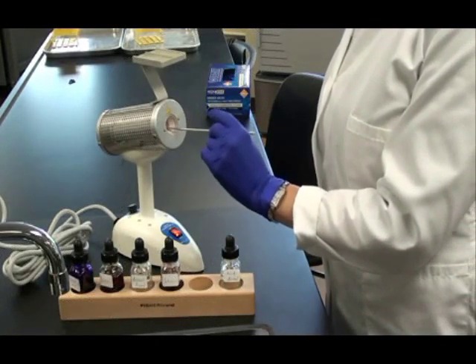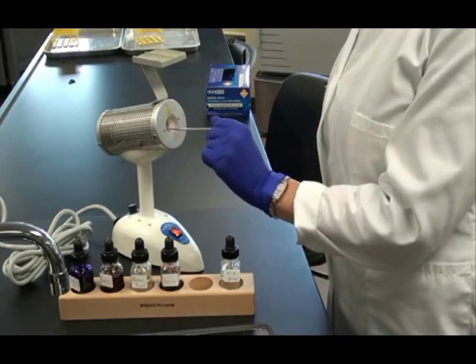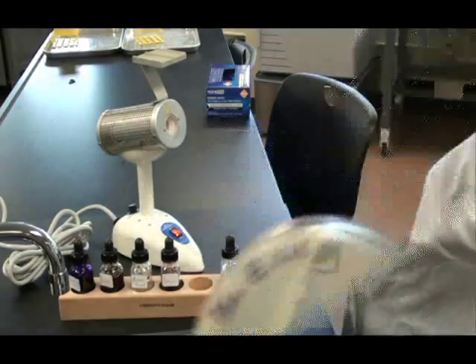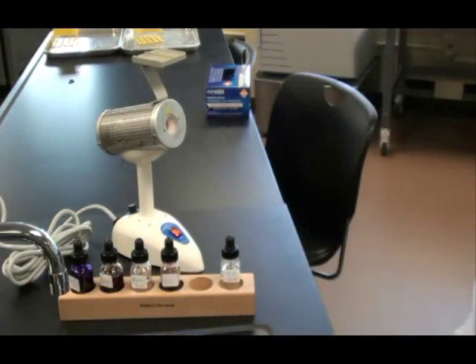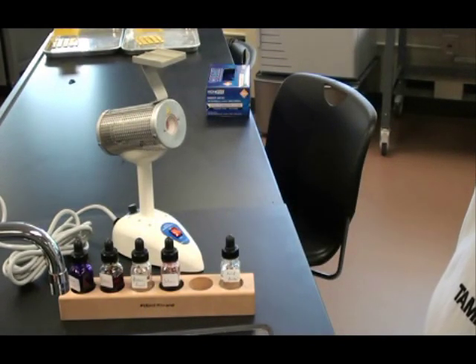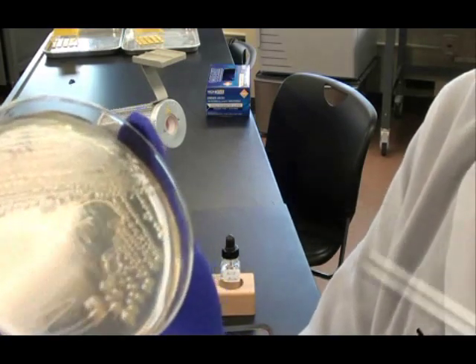I'm sterilizing my loop again inside the hub of the microincinerator. Once it's cooled, I'm ready to obtain my E. coli Gram negative sample. I use E. coli as a negative control because it's a known Gram negative organism that I can compare my unknown to.